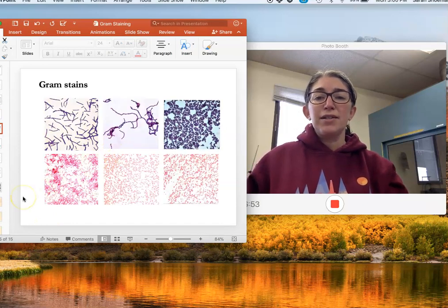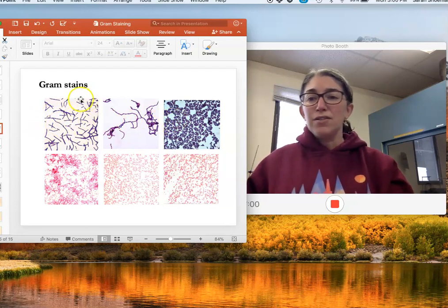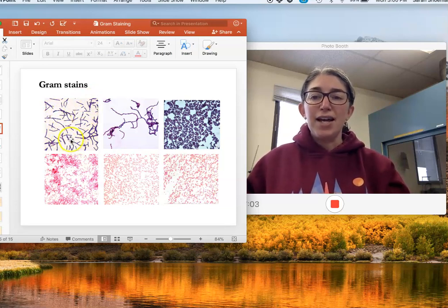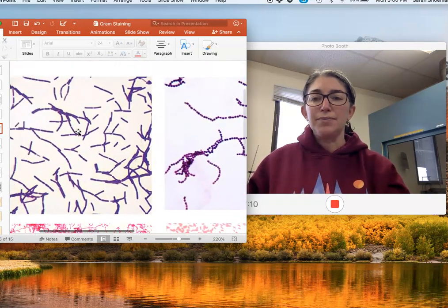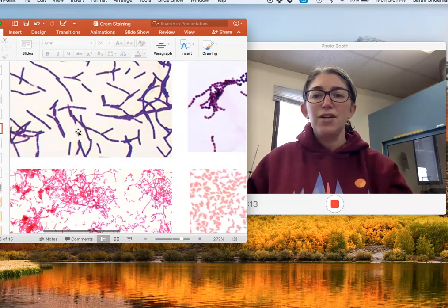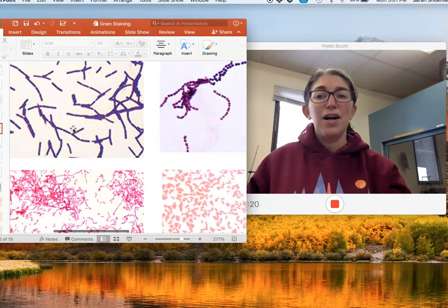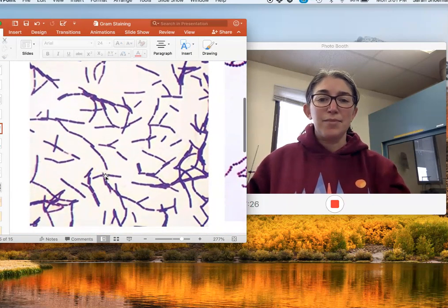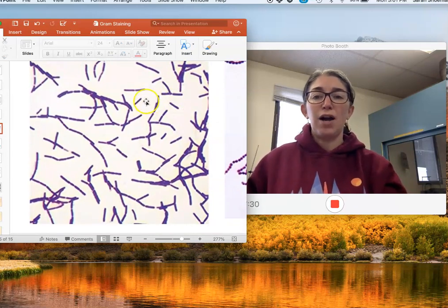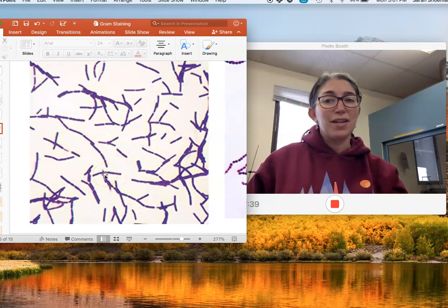On the top I have some examples of gram stained bacteria that are gram positive. Here we have some gram positive bacilli — they're rods. Bacteria are super small; this is the highest magnification, 100x using the oil immersion lens, and this is still as small as they are. These are large-ish rods, and they form a sort of strepto-pattern — these would be streptobacilli, they grow in chains.